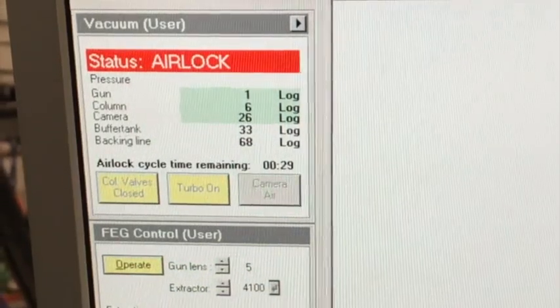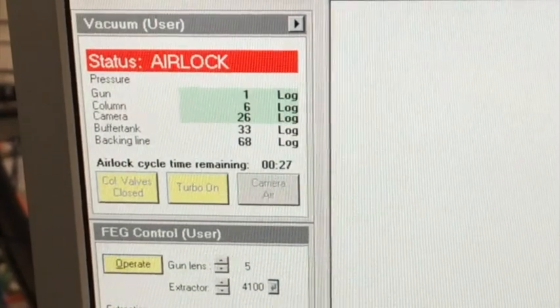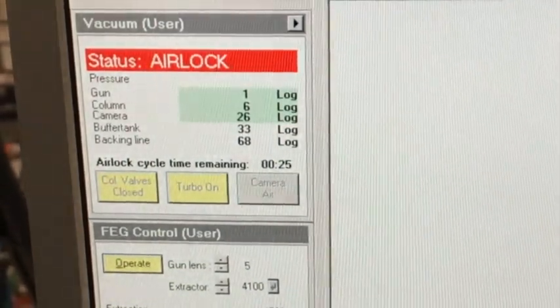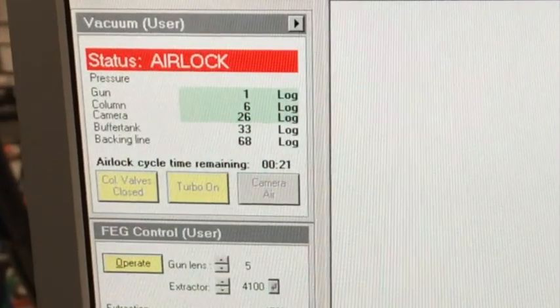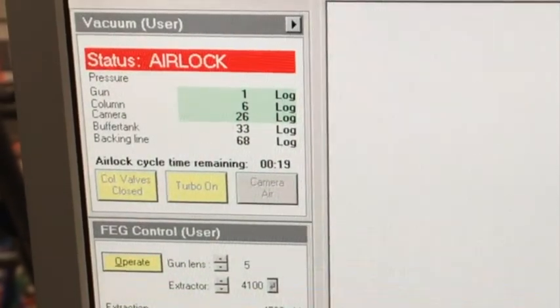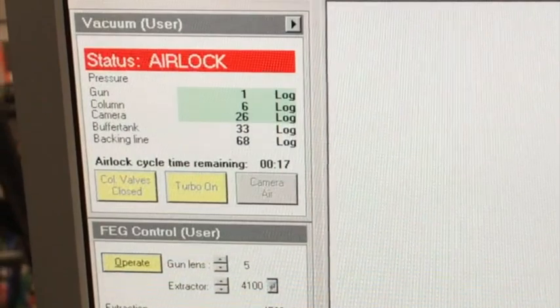As the pump is working, the airlock vacuum is getting improved. Usually it takes one minute to get a decent vacuum of the airlock before we can insert the specimen holder into the column.